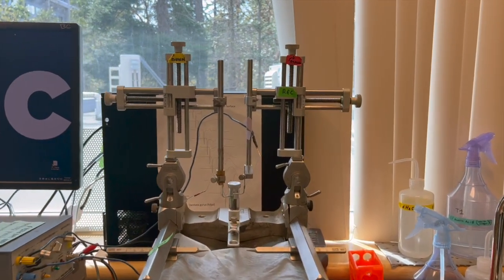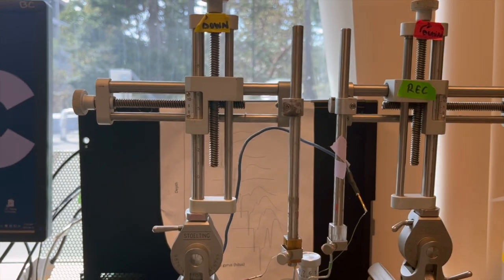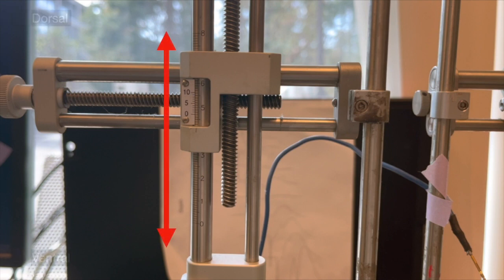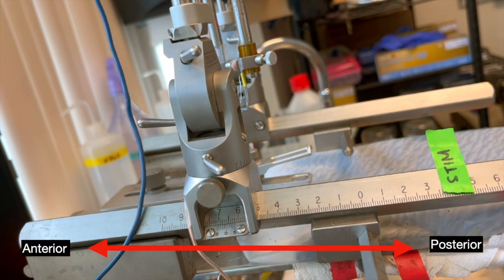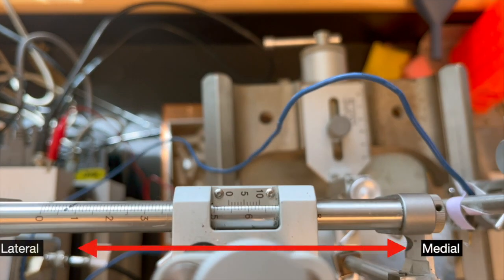As mentioned at the beginning of the video, Vernier scales are located in three different locations on the stereotaxic arms. The first, located vertically on the front of the stereotax, allows for dorsal-ventral measurements. The second, located horizontally at the base and the side of the stereotax, allows for anterior-posterior measurements. And the last, located horizontally across the top of the stereotax, allows for medial-lateral measurements.